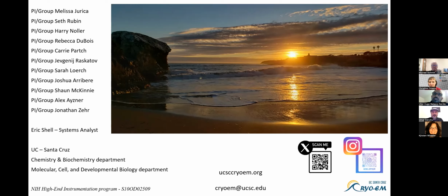Sure. It is a very interesting question because we used exactly the same grids that were previously stored at PNCC. So same sample, same grid conditions, same data processing workflow. The major difference was the equipment that we used and the data collection parameters. Usually once you start the data collection, you can see your particles, you see you have good contrast, so let's go for the magic number of 50 electrons per angstrom square.